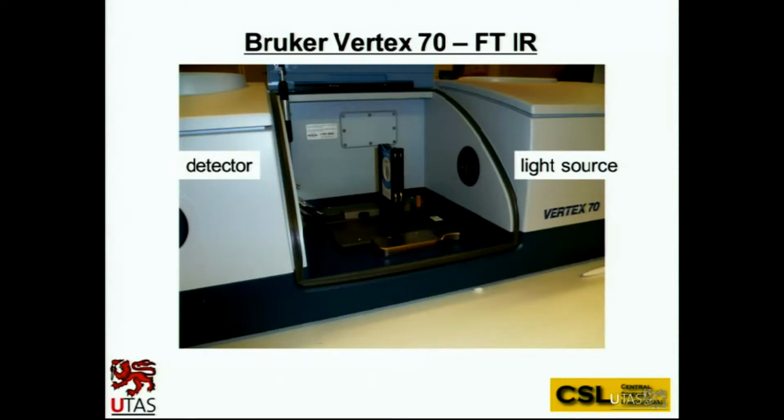Infrared spectroscopy is fairly simple in its basic setup, in that you have a light source, which is a little bit like a light bulb, but it emits infrared light, so not visible to the human eye. The light travels through the sample chamber here. In this case, I've got a little plastic film, polystyrene, in the middle. The sample will absorb some of the light, and you detect which light comes through the sample with a detector on the other side. So, in principle, a fairly simple setup.